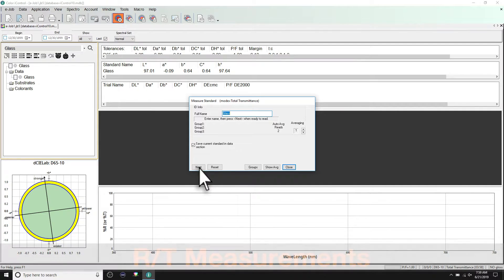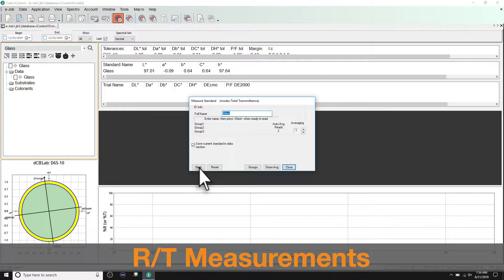RT measurements provide the ability to compensate for light loss through the sample, as opposed to light absorbed. When using RT mode for plastic formulation, the formulation software will attempt to match opacity of the standard as well as color.